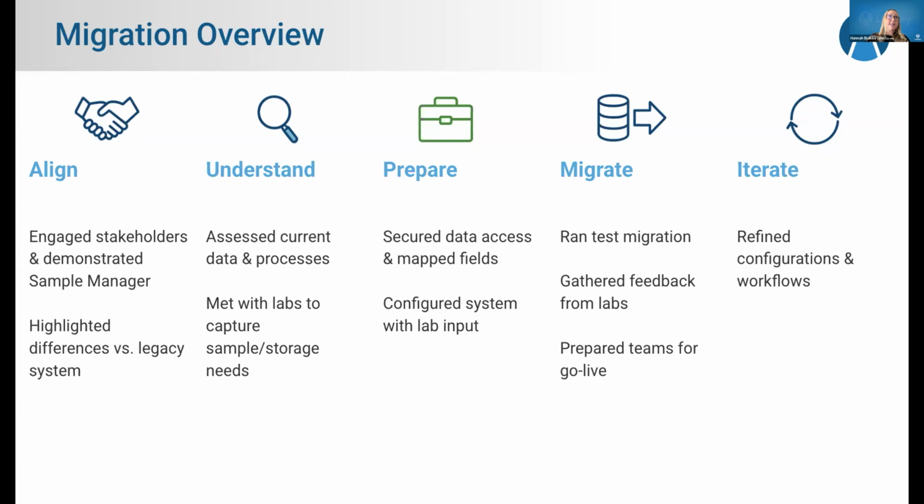So the biggest starting point was to gain alignment. This was something that was happening to the labs and the users of a sample management system rather than folks electing into it. And so we really wanted to make sure that we had that alignment and that people knew what Sample Manager was prior to the migration.